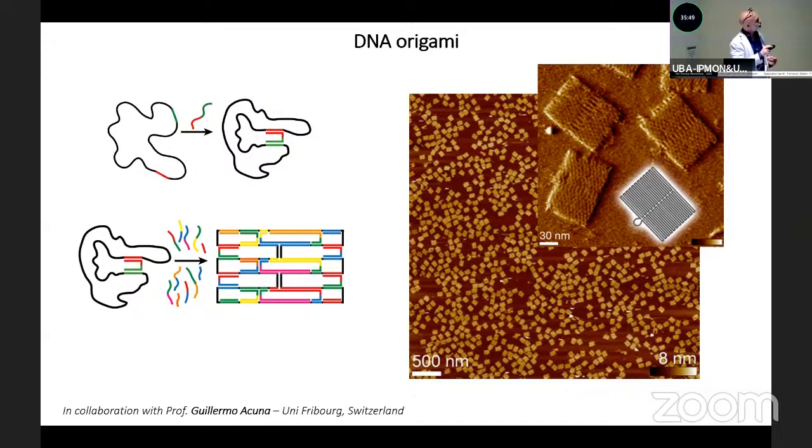we call these small oligonucleotides staples, like the staples that put this thing together. So if, for example, we take this staple here and make it a bit longer, then we can leave, at this point, a single-stranded DNA chain that will be in a specific position of the origami, and it will be available for a subsequent binding of another DNA chain, for example, holding a fluorophore or a nanoparticle or something.